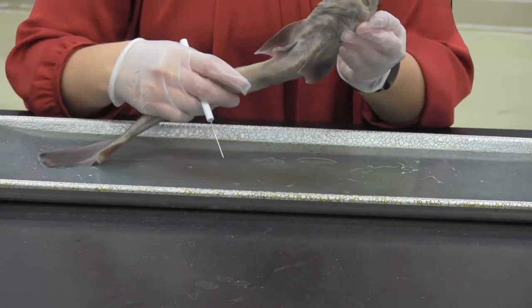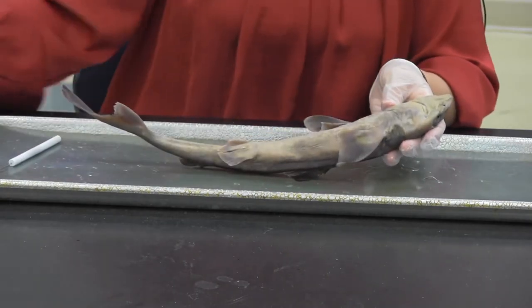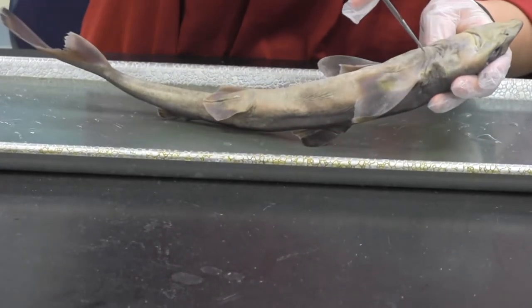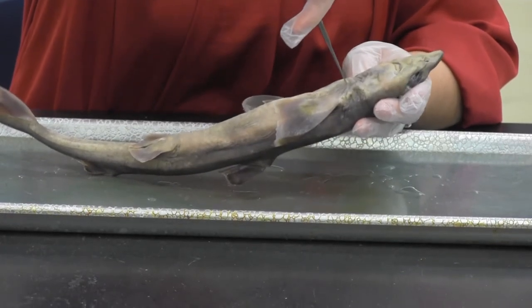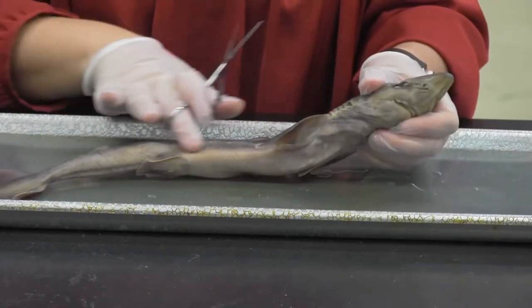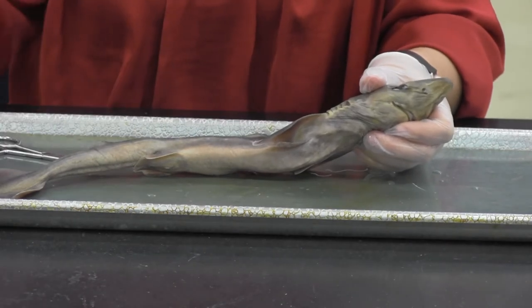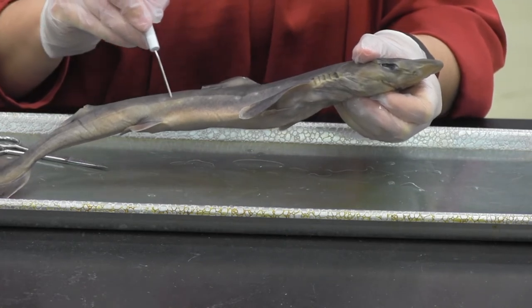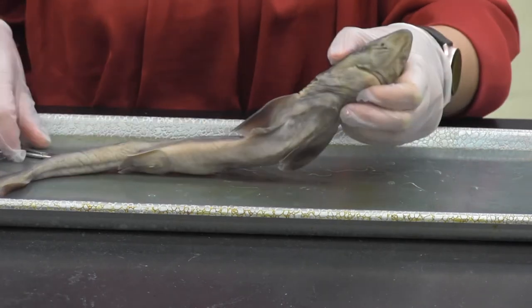We are going to cut into this shark on the ventral side and take a look at the inside. The skin is going to be super tough — if you were to feel it, it actually feels like sandpaper, which is kind of unique. If I go this way it feels very smooth, but if I go this way it feels a little rough. One other structure I forgot: there's a little line right here called the lateral line, and it's a sensory structure found in most fish.